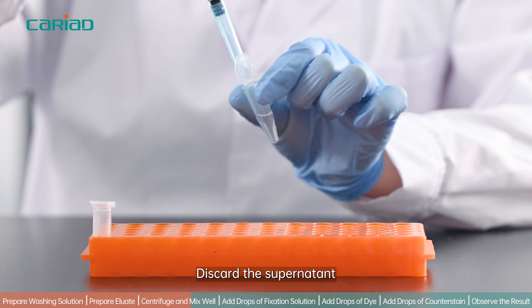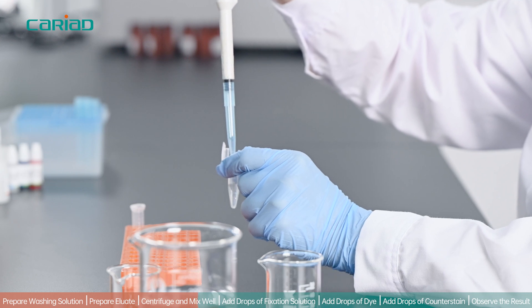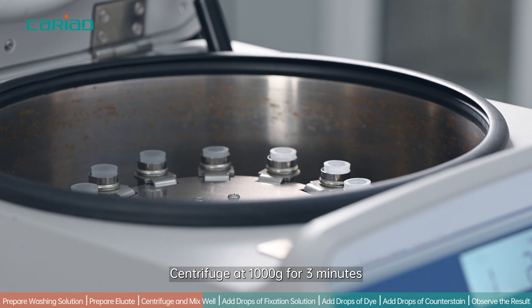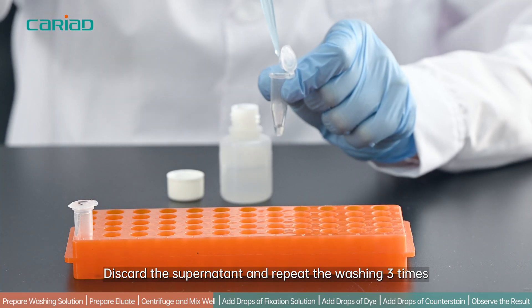Discard the supernatant. Add 1 ml of washing solution and mix well. Centrifuge at 1000g for 3 minutes. Discard the supernatant and repeat the washing 3 times.